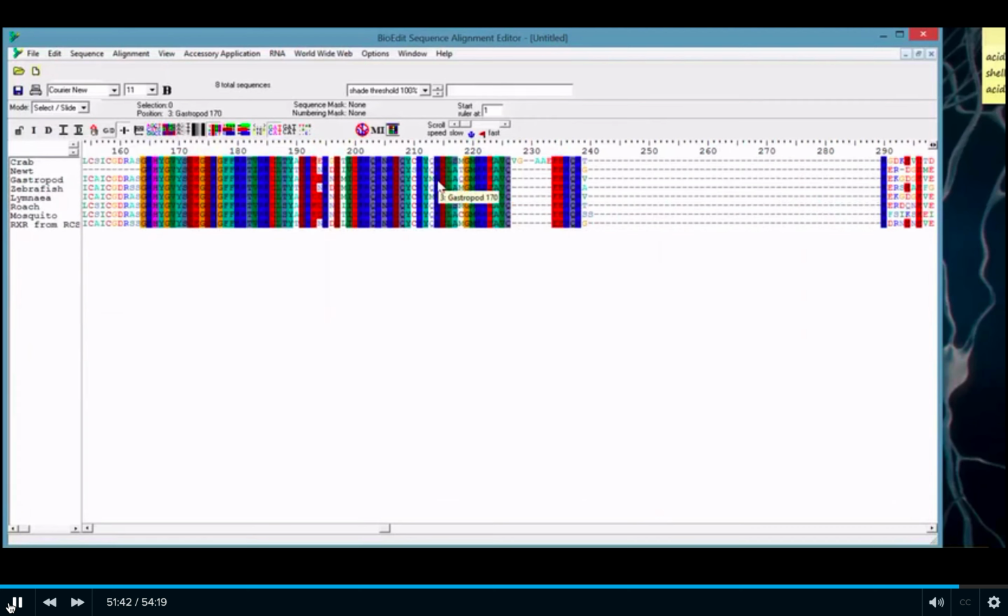And if we wanted to see just the absolute core of the protein, if you could boil it down to the most important 3 or 4 residues, that's fine. You would have to have even more sequences here to see what's in common. If you want to see a chunk of a protein, you'd use fewer animals that are all closely related. If you want to see the bare bones essentials, then you'd have a wide range of species here. But you would simply run an alignment and see what's common.